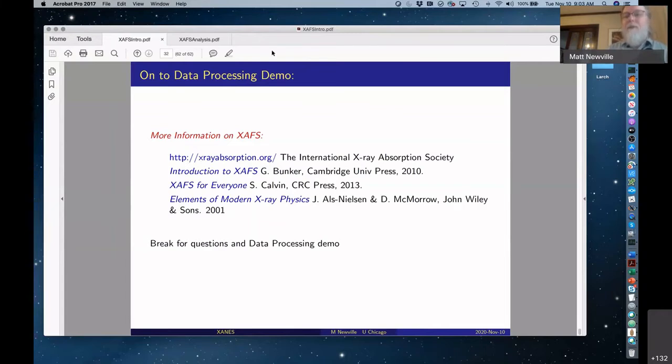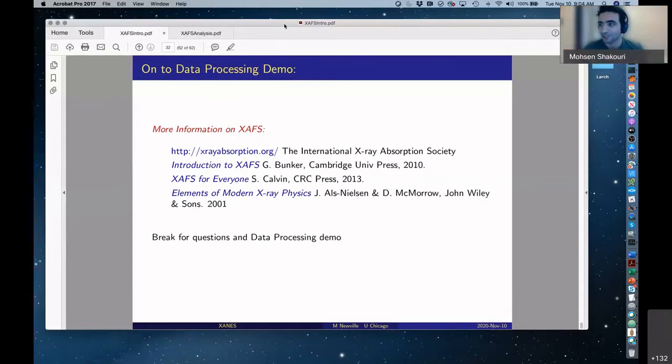There are other methods, so you could look at the XANES. You could look at the XANES spectra and see if you can distinguish sulfur from chlorine ligands. And there are advanced emission spectroscopic methods, valence-to-core methods. These are advanced and can't work on every system, but they work quite well on many of them. Okay, I hope we answered the question.